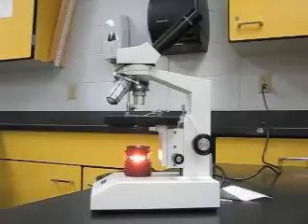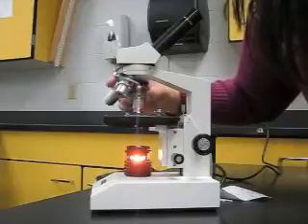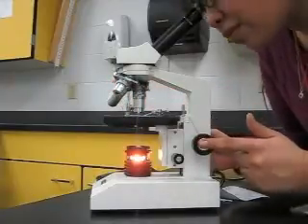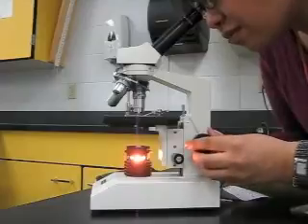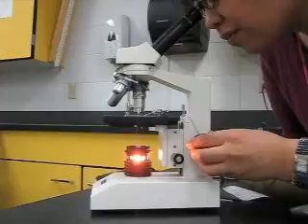This clip here shows you what you might see when you're looking in the microscope under the 4x power. Once your microscope is in focus in 4x, you can move up to a higher power. In this case, we're moving to the 10x. Look through the microscope, through the eyepiece, adjust with the coarse adjustment knob until it is in focus.